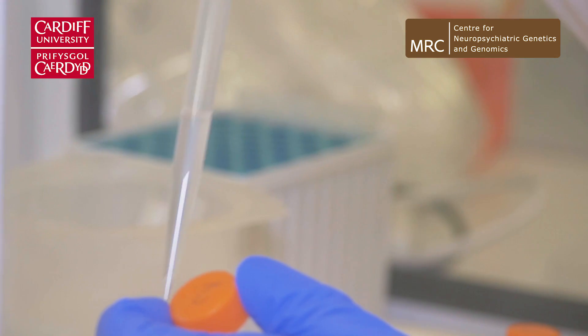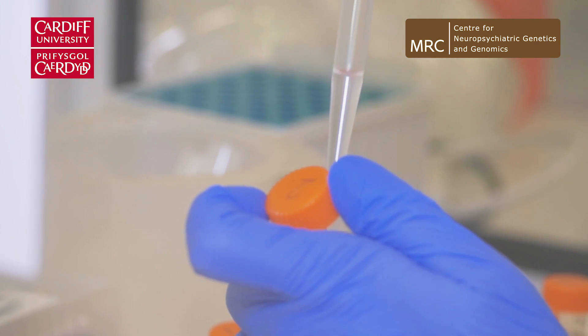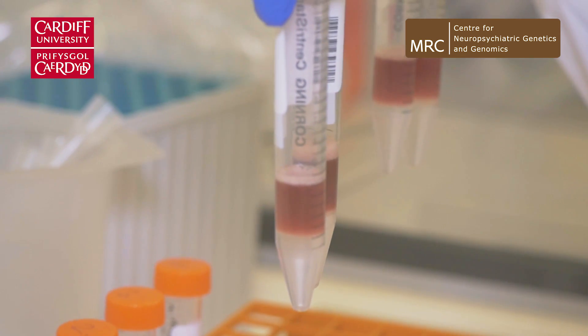The DNA will want to be in the water layer — it's hydrophilic — and all the cellular contents that we've treated will want to be in the chloroform layer, the hydrophobic area. So we give them a good mix.